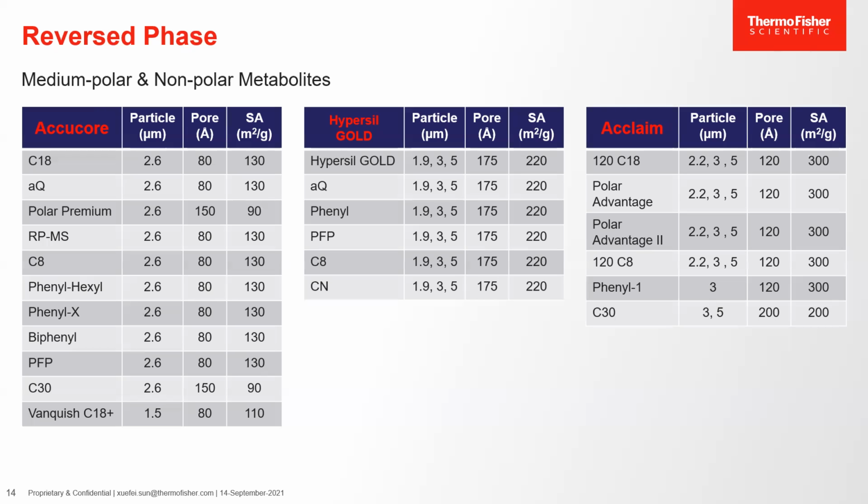They are going to differentiate in the pore sizes as well as the surface area. So there's a couple things to look at when we are comparing columns that you might already be using somewhere along the lines. We have Phenomenex, ResTech, Waters, Agilent, Shimadzu, and then we have Thermo. Everyone's got a C18 column. So what's going to make you choose a Thermo C18 column over an Agilent C18 column?